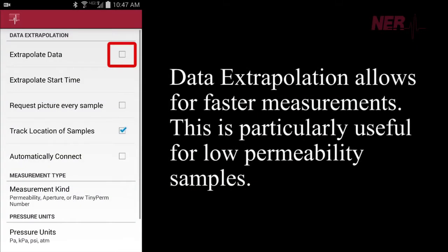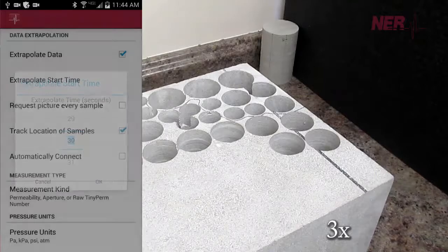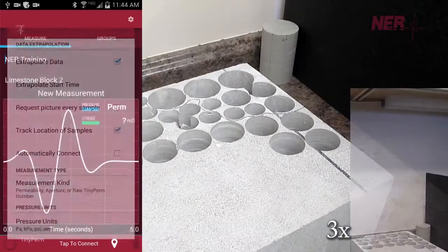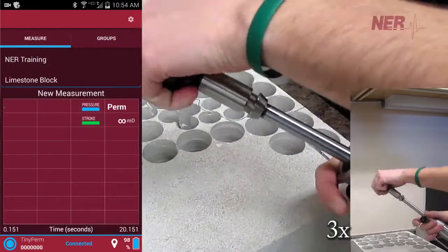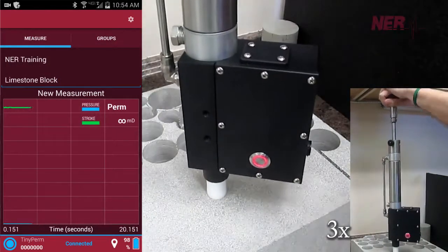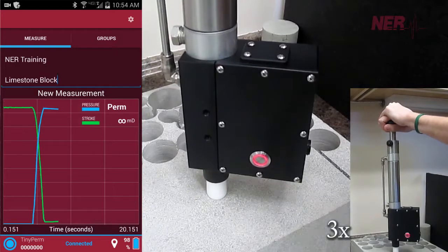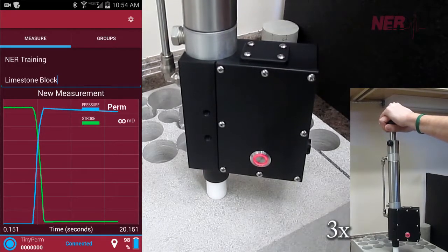New capabilities in TinyPerm 3 allow for faster measurement times at low permeabilities. Data extrapolation is set for 30 seconds, and after that time there is no need to continue. With low permeability samples, this can significantly lower the required time for a measurement.